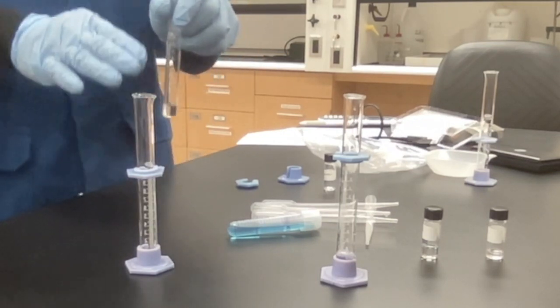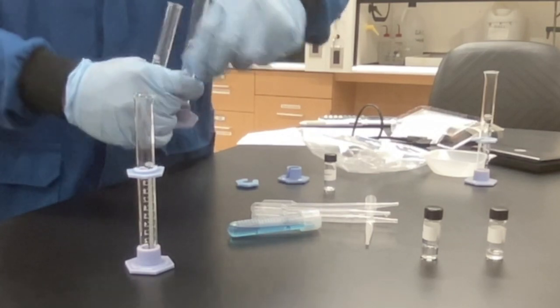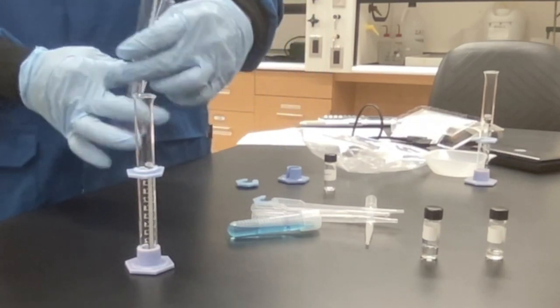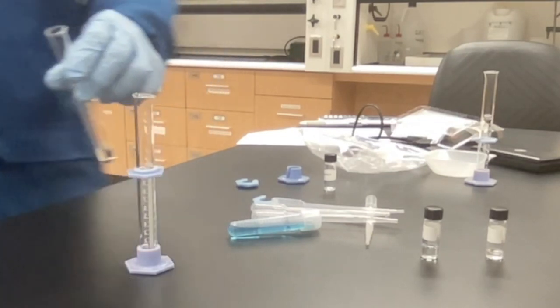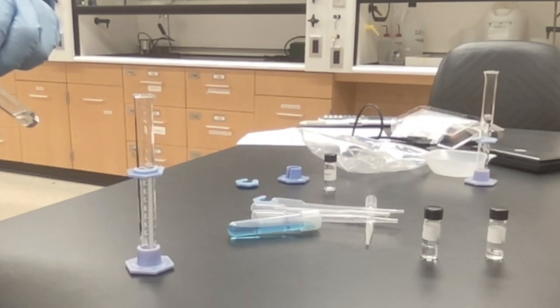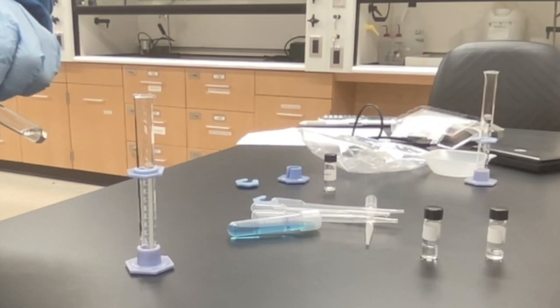Next, find your next more dense liquid, and then slowly pour the liquid into the first so that it doesn't mix. And you can do that either using a Beral pipette if you want, or you can just slowly pour the second liquid into the first down the side so that it doesn't mix.